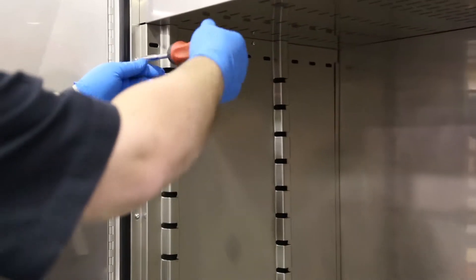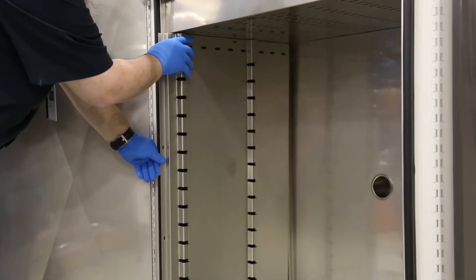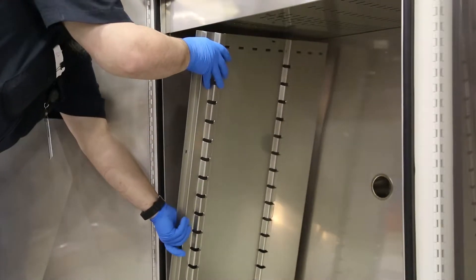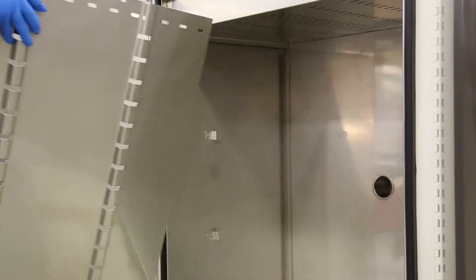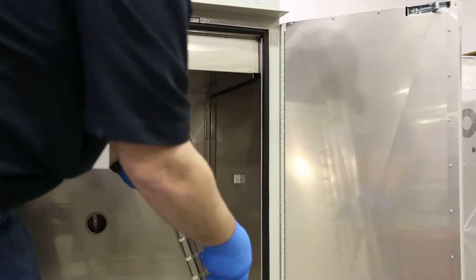Remove the five screws from the side panel with a T15 driver. Once screws are removed, slide the panel forward to release from the back slot and then tip the top in and remove the panel. Repeat the same process for the other side panel.